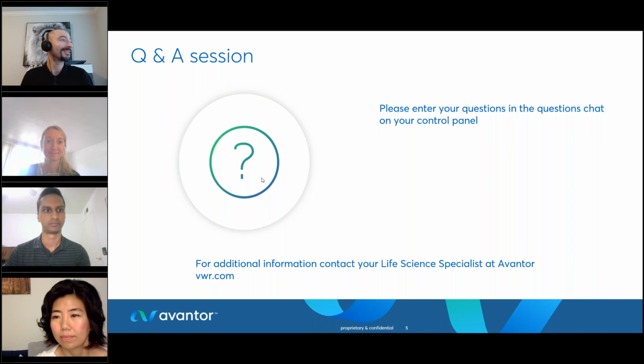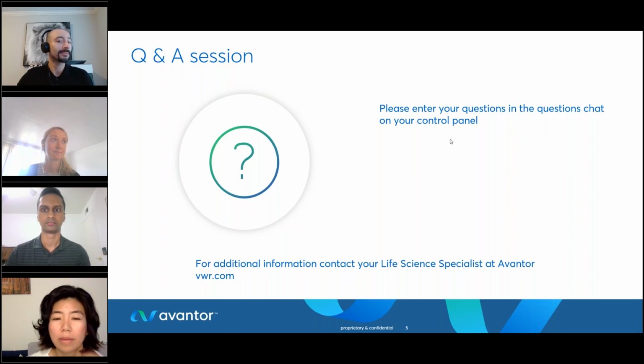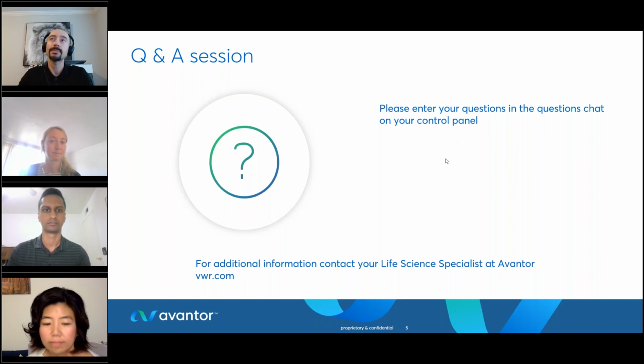The next question is for you, Jan. Can one use also the ligation sequencing kit and the native barcoding kits? Yes. So related to what Aaron just answered, if you use the ligation kit, you need to make sure to linearize the circular plasmid DNA first, so that it has double-stranded DNA ends to ligate to the barcodes, and then the sequencing adapter for sequencing. It will be a longer library prep compared to the rapid library prep protocol Gemma talked about.